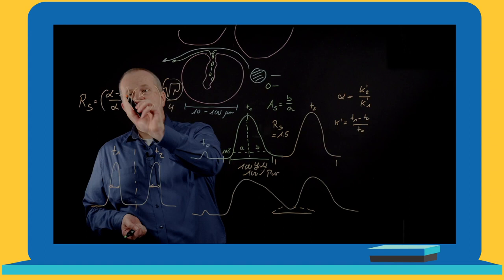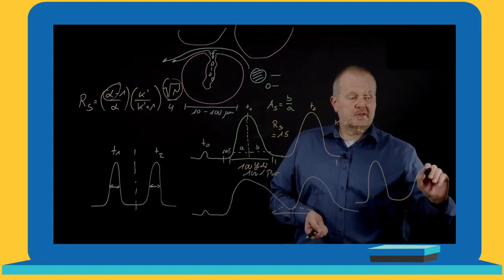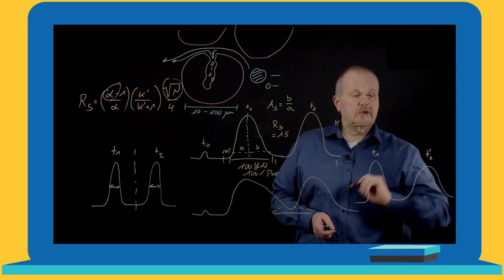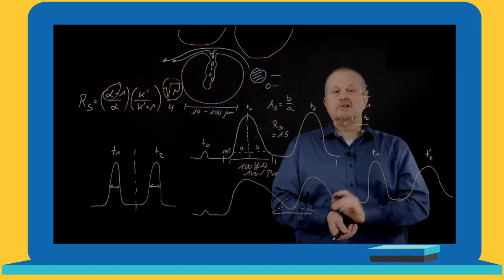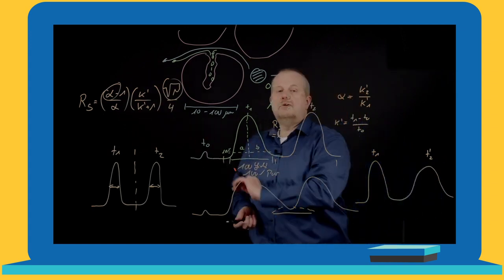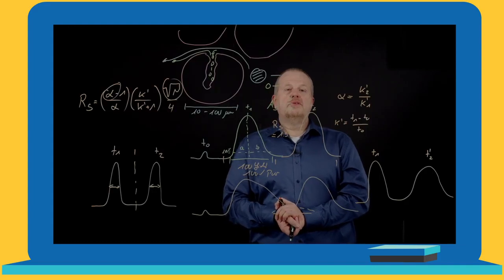What is without limitation is to increase selectivity. When we increase selectivity, the peak width stays the same, so not very efficient peaks. Let's say T1 stays the same, but T2 is now longer because we have increased the selectivity, and increasing the selectivity in this case means the attraction forces for our second compound of interest are higher than in the original chromatogram. So increasing the selectivity is the best way to optimize our preparative separation.